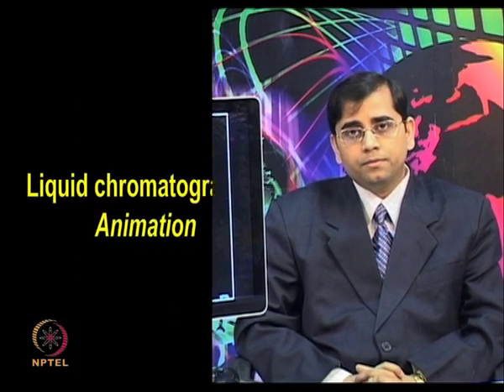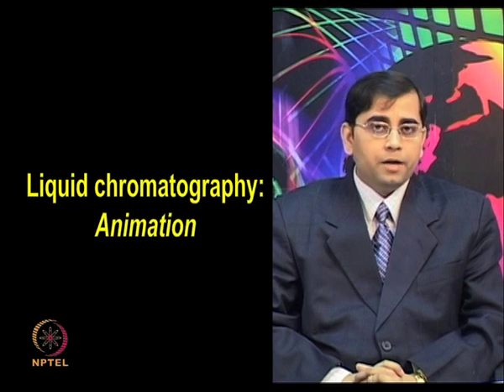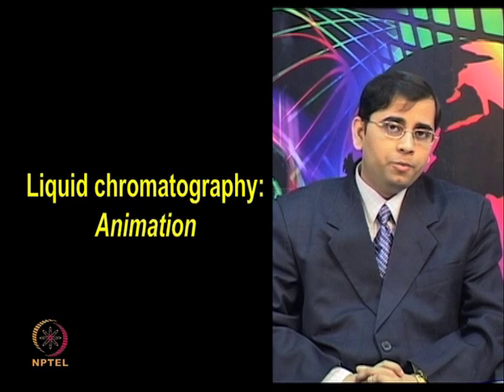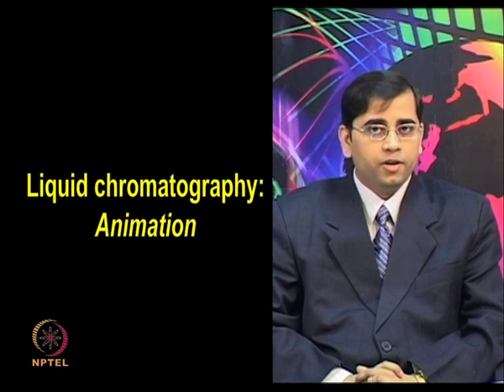Let me describe some of the concepts involved in liquid chromatography in the following animation. I will also discuss MudPIT and some of the chip based approaches which are integrated for proteomic application with liquid chromatography. So, let us discuss these concepts in the following animation. A typical liquid chromatography setup consists of solvent bottles, degasifier, dual or quaternary pumps, sample injector, column and detectors.